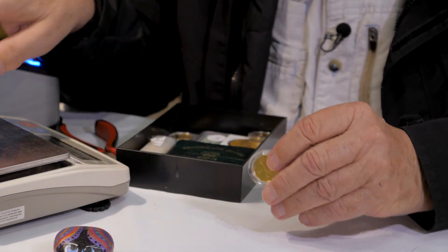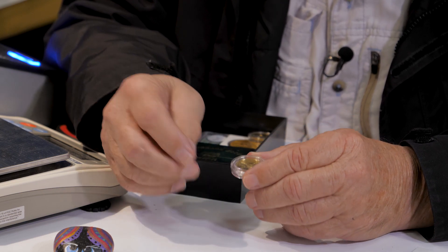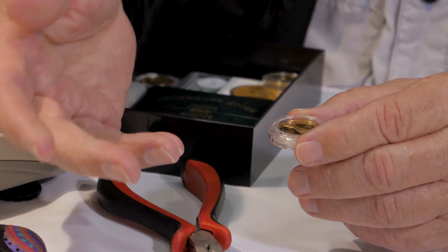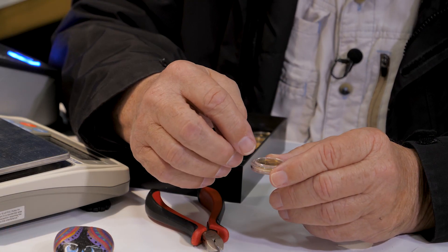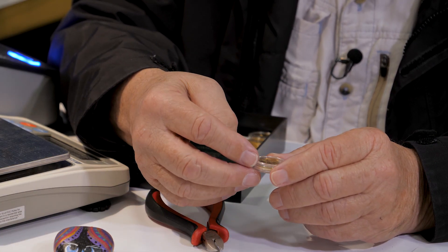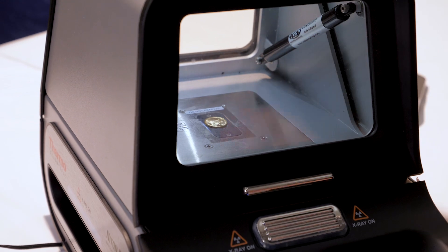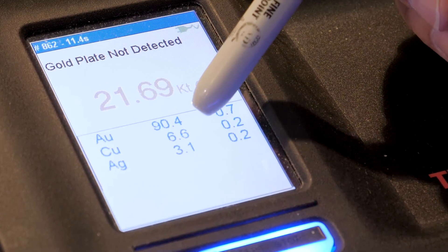Not too many years ago, before the Niton DXL came on the market, we used to have to take a knife or screwdriver — some type of sharp object — scratch across the surface, which would mark the jewelry and devalue it, and then you would put your acid on there. It would turn a different color. You could test gold, silver — different acids would test for different carats of gold. Whereas the Niton tells you exactly what you have, with the full quality of metal broken down.